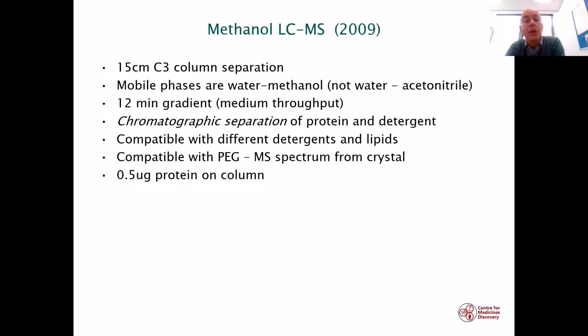The reason we don't use that technique anymore is we developed a new method, and this is an LC-MS method based on the use of methanol. Normally, for LC-MS, we would be using acetonitrile. We discovered that actually it's not really possible to do LC-MS analysis of membrane proteins in the presence of acetonitrile, but it is possible in the presence of methanol.